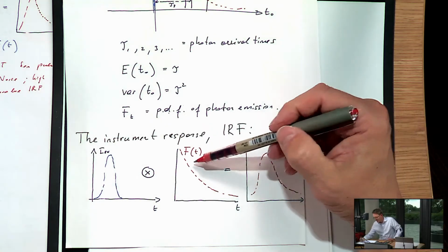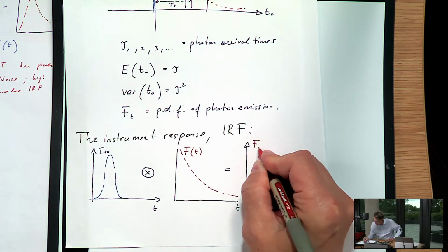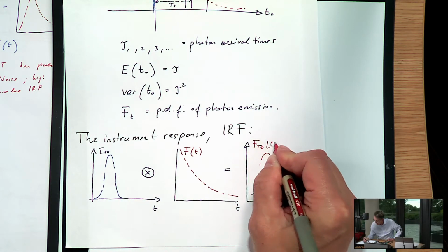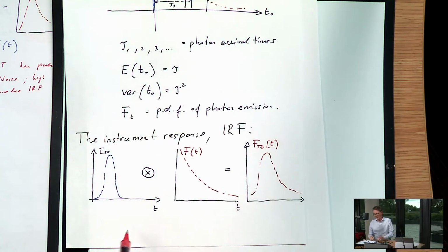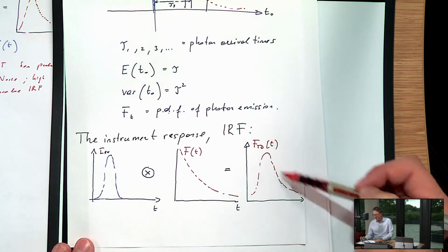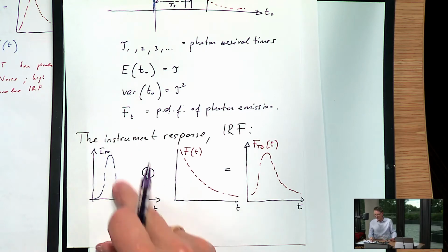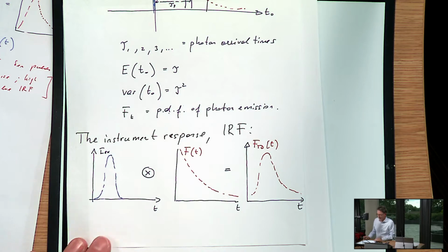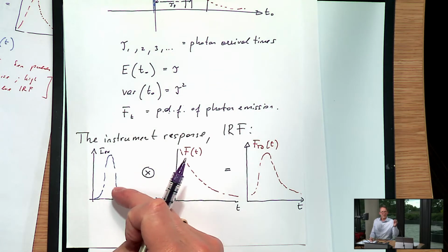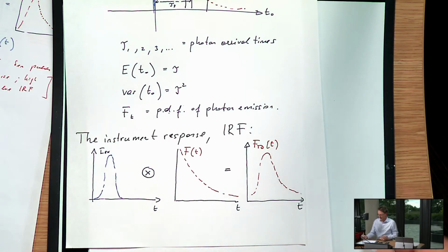So for very accurate measurements, you have to deconvolve this. We call this function now f time domain of t. So the FTD, just say this is the time domain signal that I get. Putting this pulse in, I will get this time domain signal as a function of t coming out for an excitation pulse of that shape, either putting that into lots of molecules or repeating this with low intensity pulses on individual molecules one by one. I'll get this sort of arrival time distribution as a result.